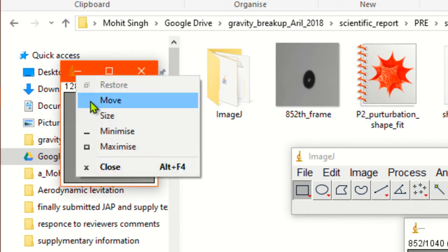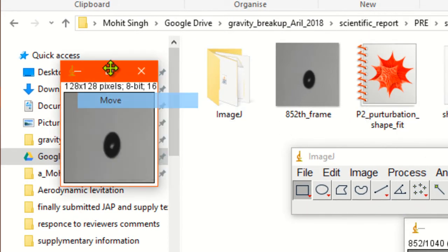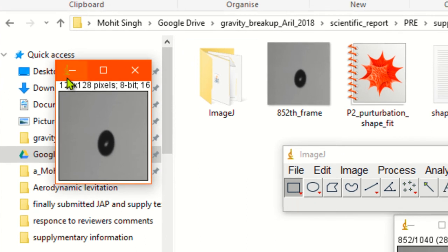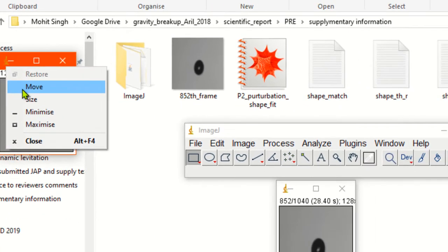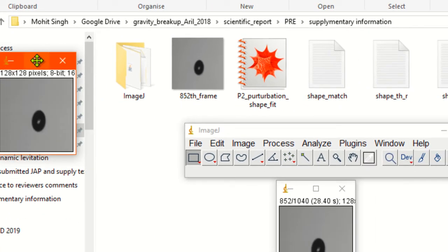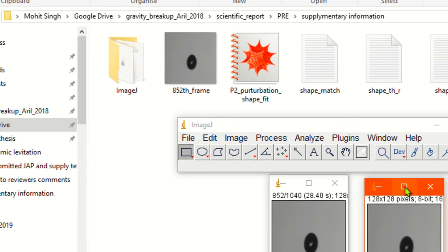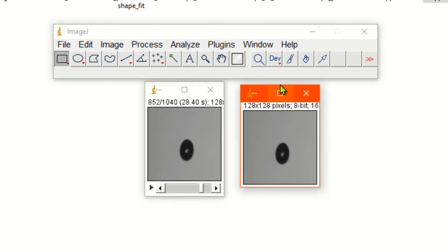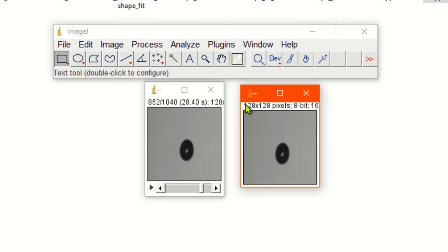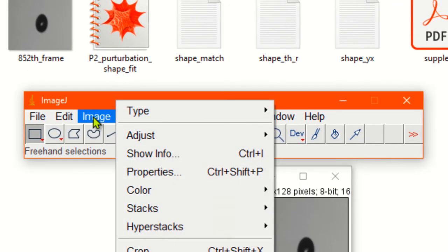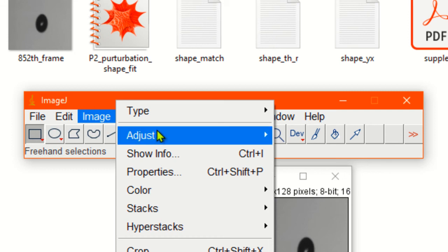Since we do not want to duplicate the whole video, we will not check this box. We want to duplicate the particular frame which corresponds to 28.4 seconds. Just click okay. Now let's move it to the center again.